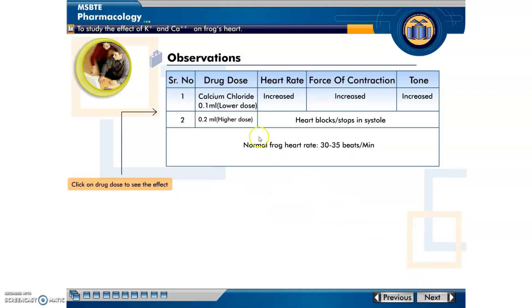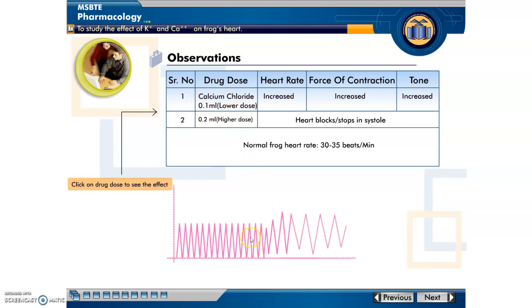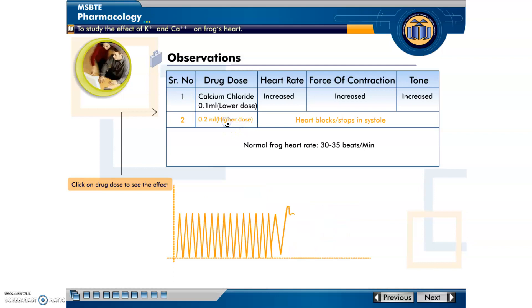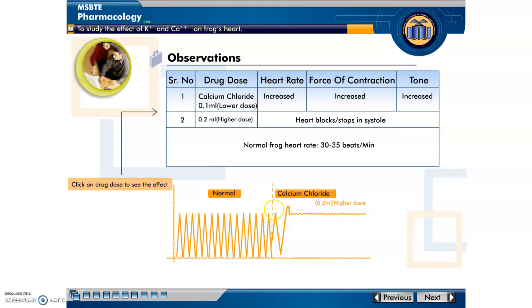For calcium chloride at 0.1 ml dose: this is the normal response, and the increases in response show that heart rate, force of contraction, and muscle tone are increased. But when we inject a dose of 0.2 ml of calcium chloride, the heart shows a straight line graph at contraction mode, meaning the heart stops in the contraction phase.